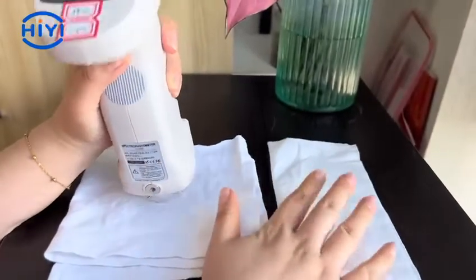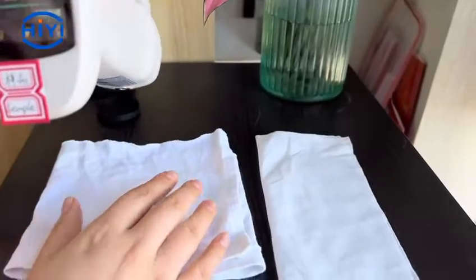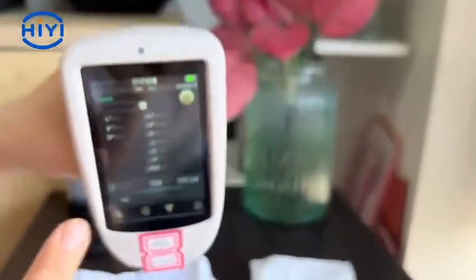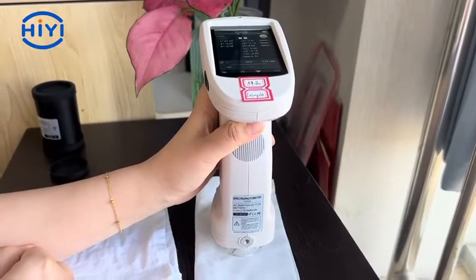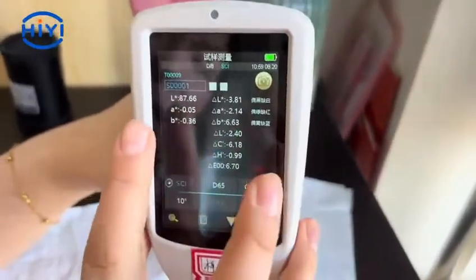Now we add the left one as the standard fabric, to test the right — the other fabric. So we need to press the sample measurement button. Put the spectrophotometer on the other fabric and press the black button.